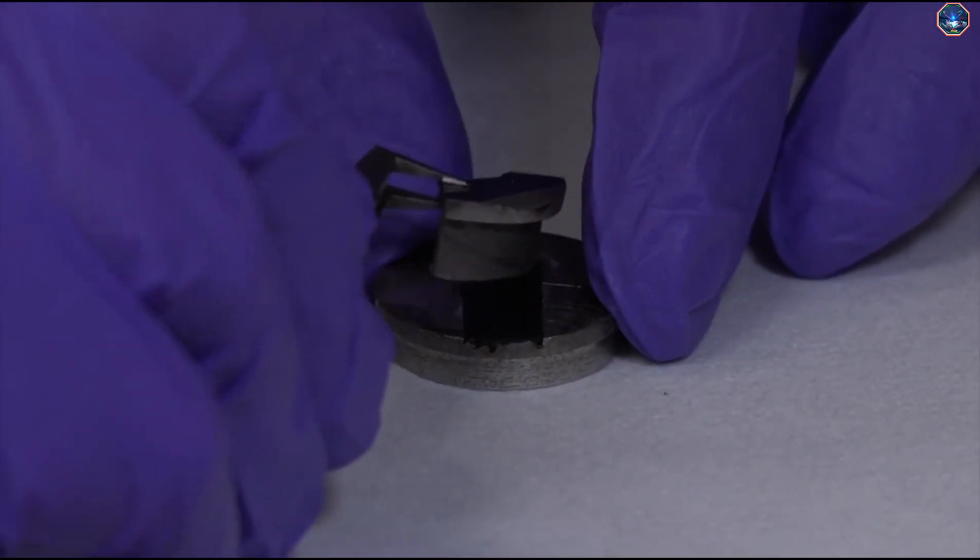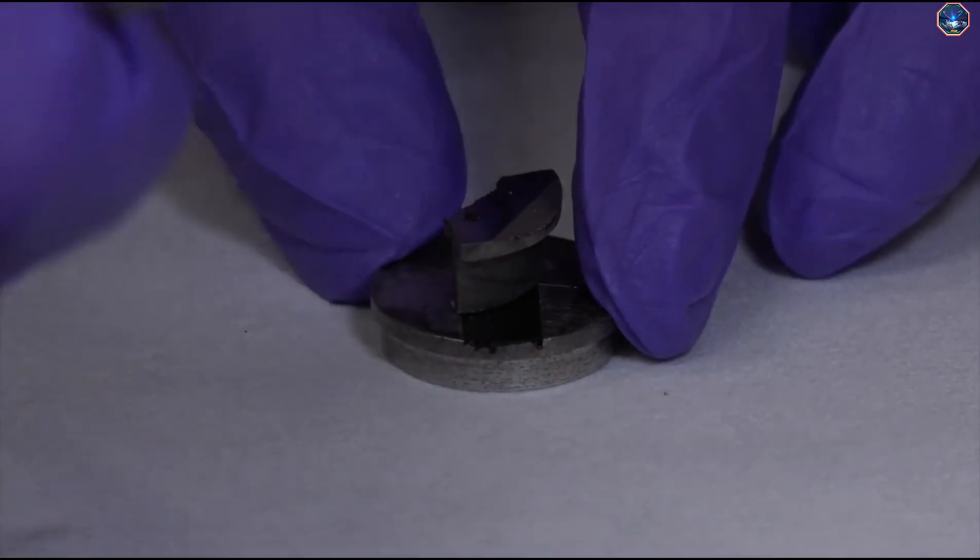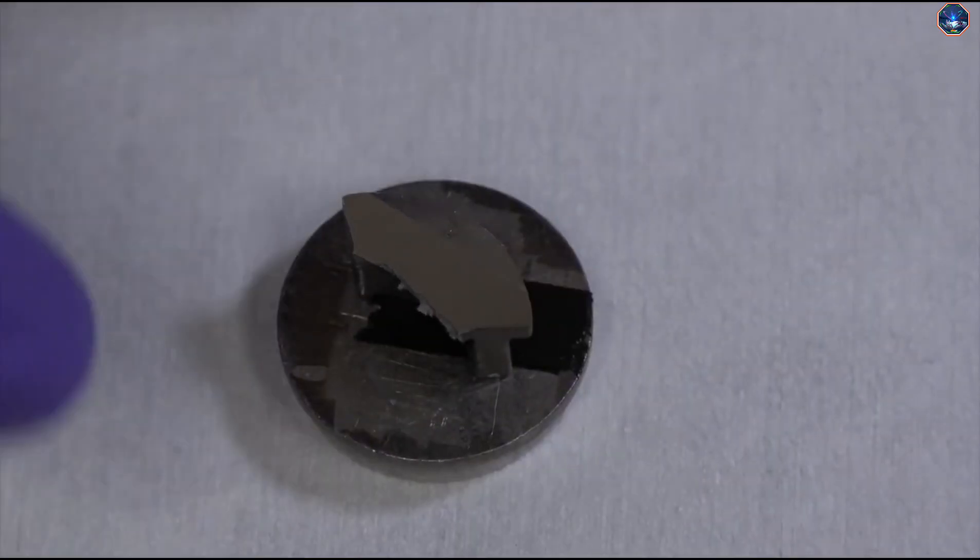Using forceps, pick up the sample and carefully place it on the tape. Gently press down to make sure the sample adheres to the tape.